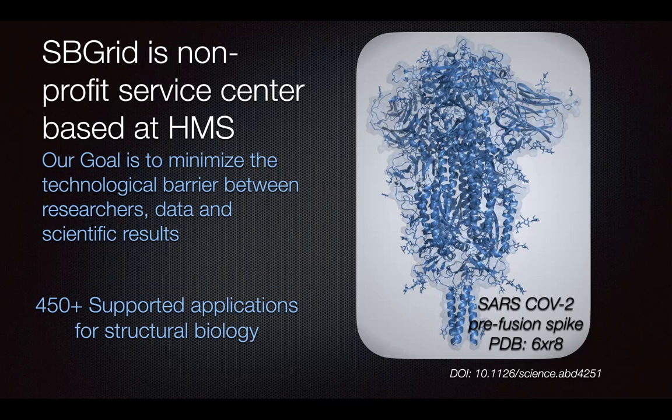So we follow the developments in these software projects. We work with developers. We keep the latest versions installed and around, and we're structural biologists, in the structural biology community here at HMS and Harvard. So we're using them. We know not specifically every application that we install, but we know people who are using basically every application that we install. So we can referee and curate these in a way that hopefully works scalably for the community.